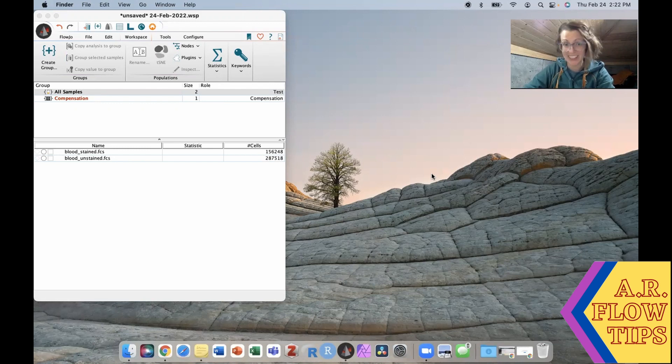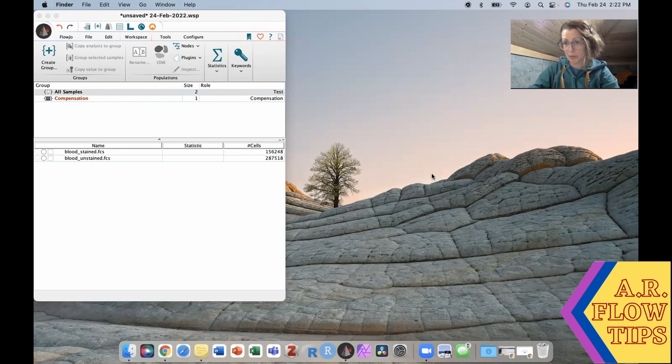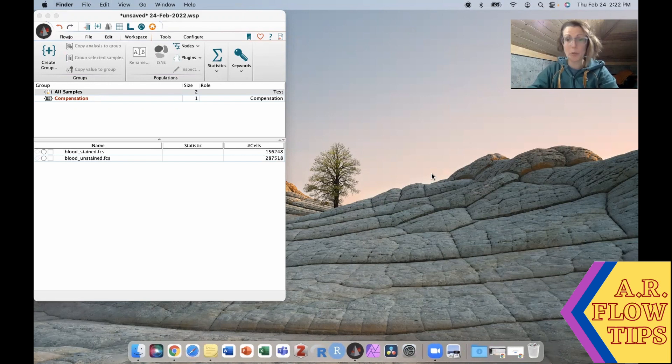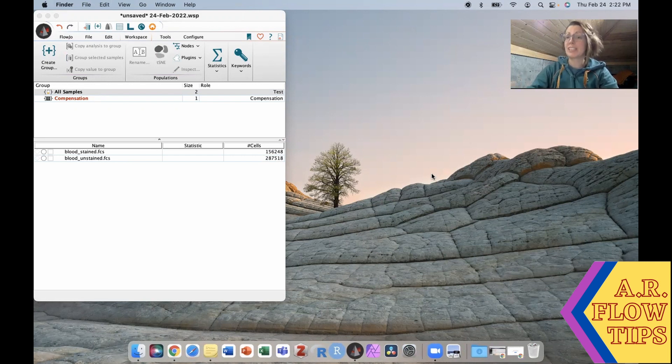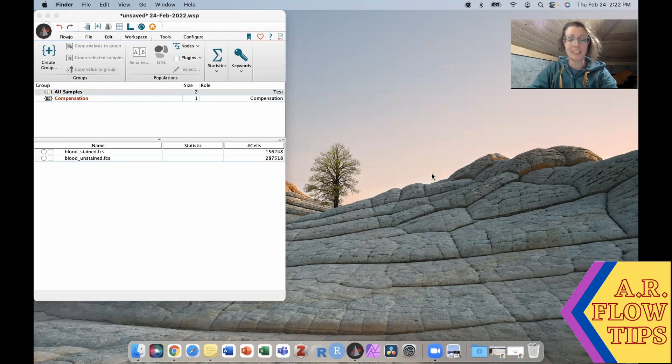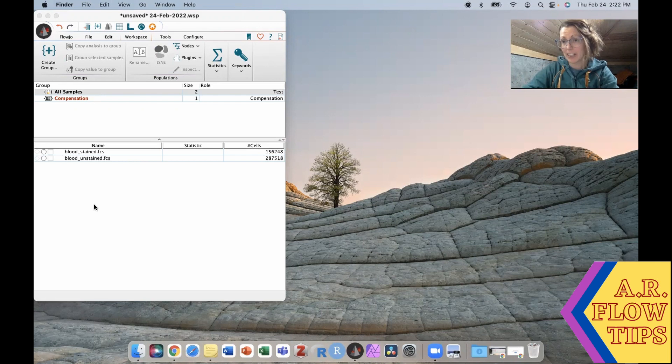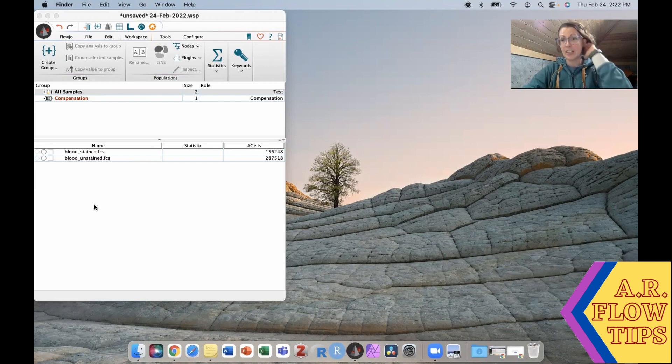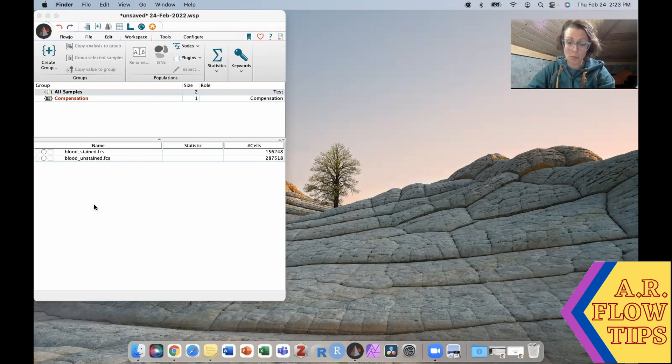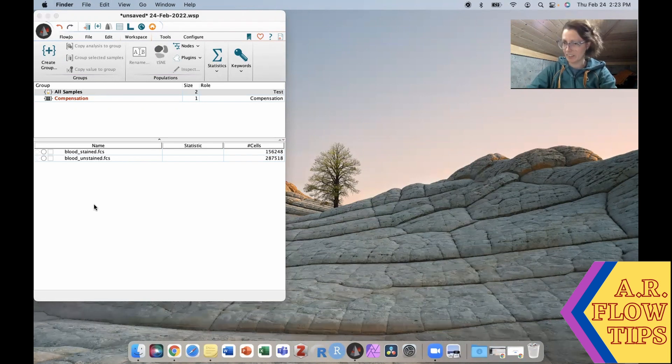Hello and welcome back to the channel. Today in our continuing FlowJo adventures we're going to look at some basic steps to perform cleanup on your flow cytometry data. I have just a basic experiment here, two samples, stained and unstained blood on a 12 color panel. I've previously analyzed these but just to work through my data cleanup process.